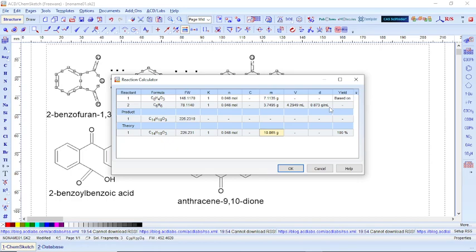So can this software tell us the volume of the solution? I don't know if I'm coming to that angle now. Yeah, you are all there. So since our phthalate anhydride is solid and we want to do the reaction, we must definitely dissolve it in water. So can we know the quantity of water that we are going to pour to dissolve it?